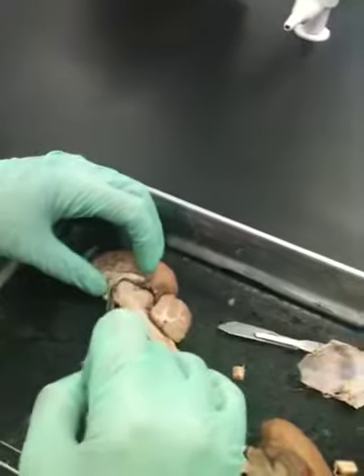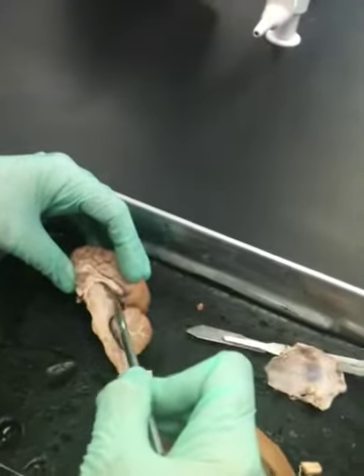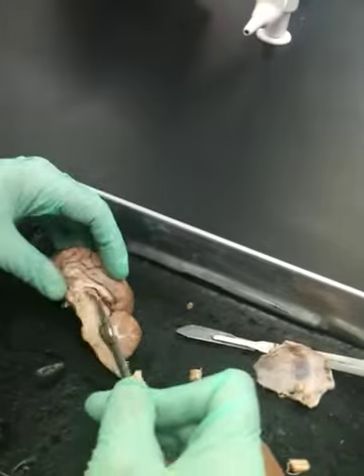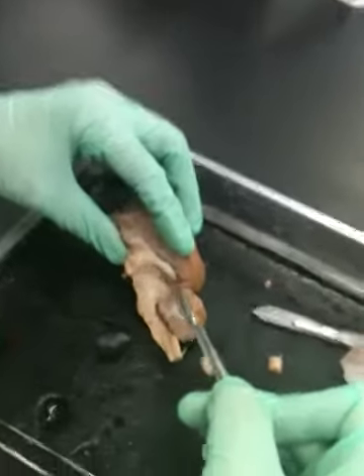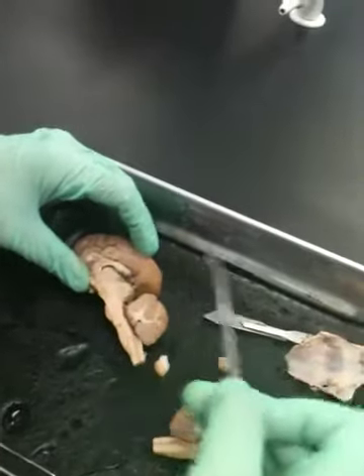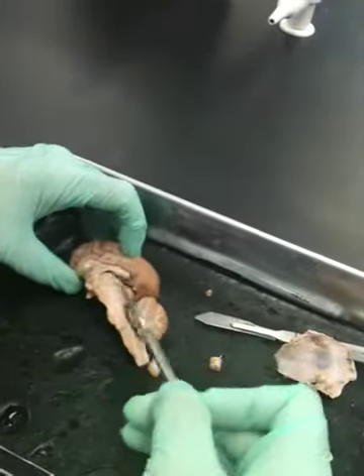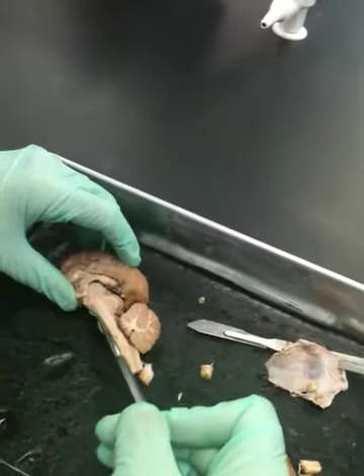All right, if this is third ventricle, then what is this structure that's egg-shaped? Thalamus. Okay, see how this one, you didn't quite hit it mid-sagittal, which is okay. Somewhere in there would be the intermediate mass, but you don't worry about trying to find it because it's the same color as the thalamus, so you won't be able to find it on this guy.